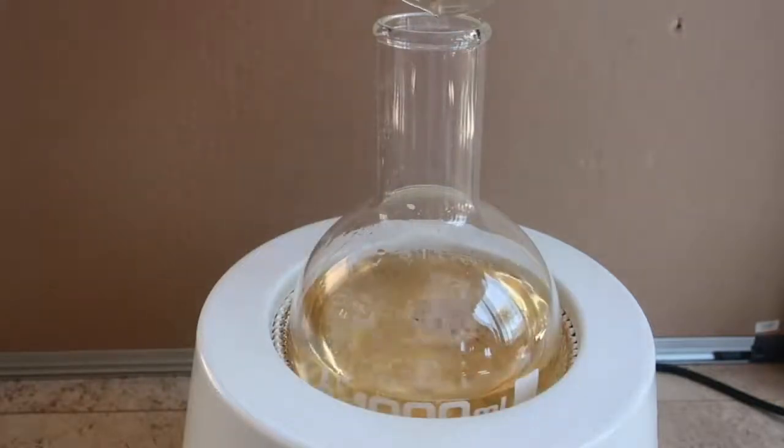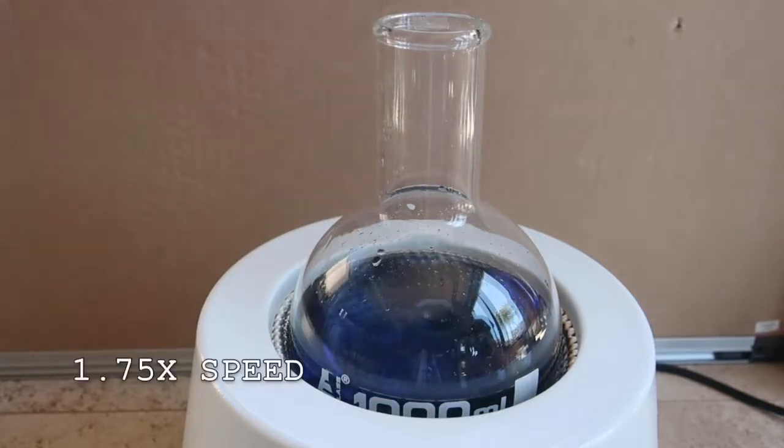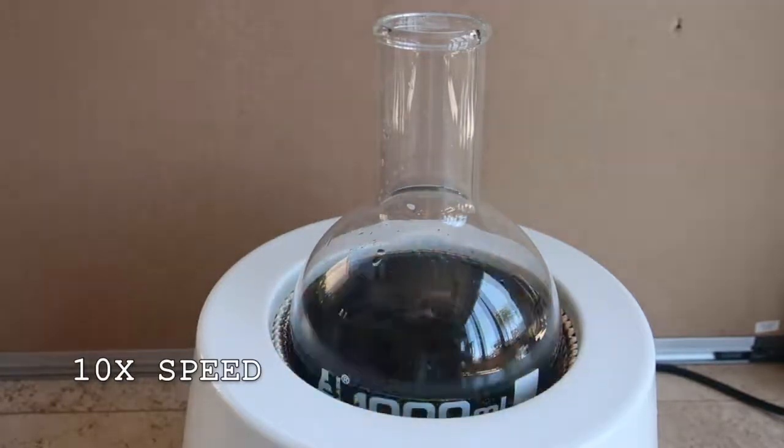The entire mixture turns yellow, and then boom, it turns a dark blue-black color. The solution begins to lighten in color until it turns clear again, then it goes back to yellow, and then back to a dark blue. The reaction oscillated back and forth 9 times before it stopped.